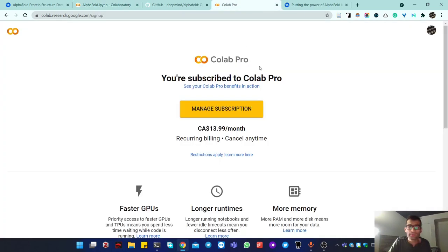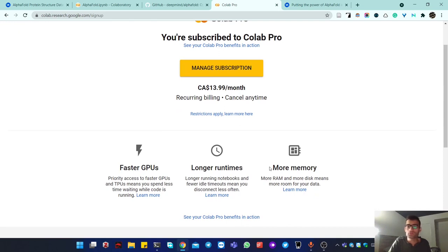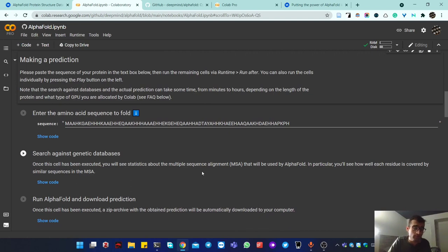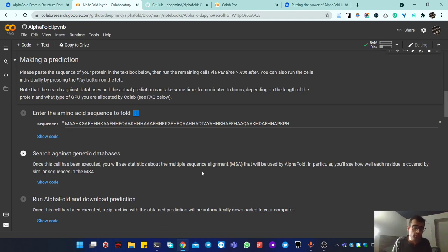You can upgrade to Colab Pro, which is a paid subscription that gives you faster GPUs and more memory. For most proteins, this will be sufficient. And even though it's not the full version of the algorithm, it's very accurate — I compared it to a crystallography structure from UniProt and the result was amazing. I also used it for a protein with an added linker, and it was a great experience.